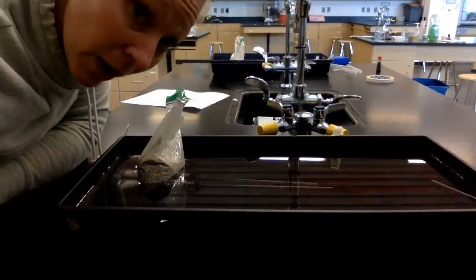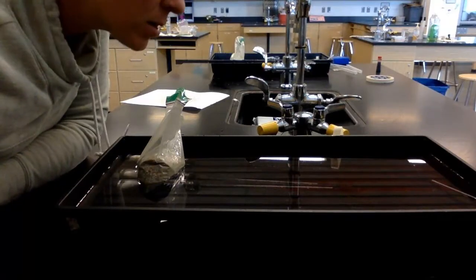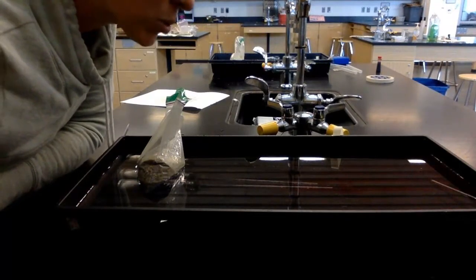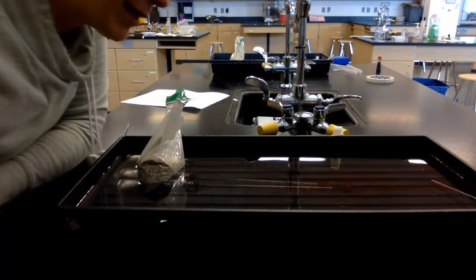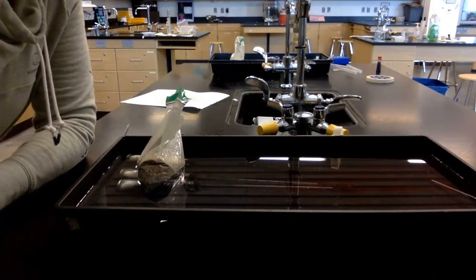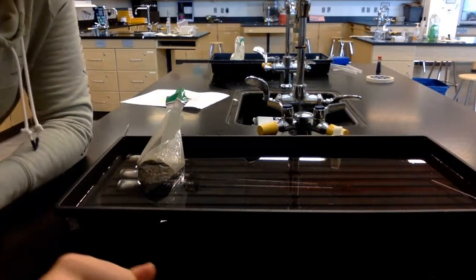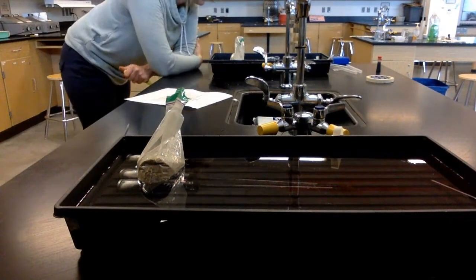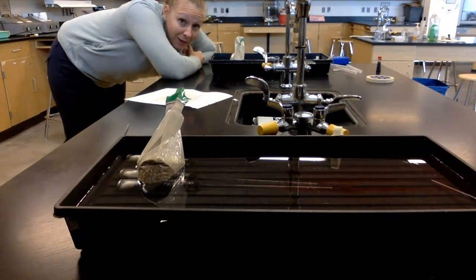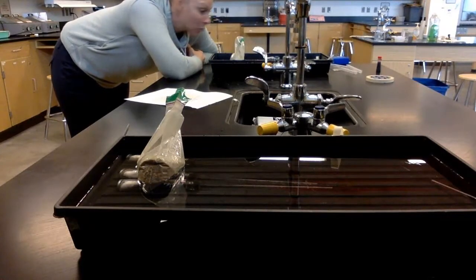At minute 10: respirometer one is 0.77. Respirometer two is 0.87. Respirometer three is 0.90. Respirometer four is 0.85. Respirometer five is 0.87. Respirometer six is 0.93.